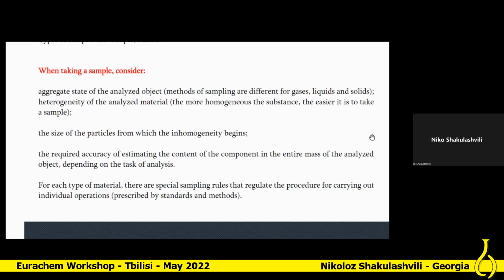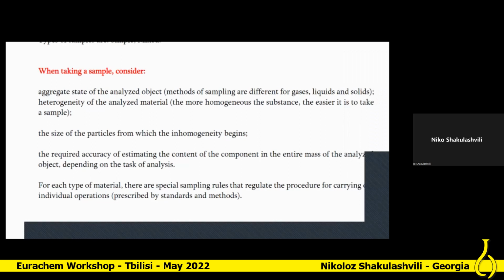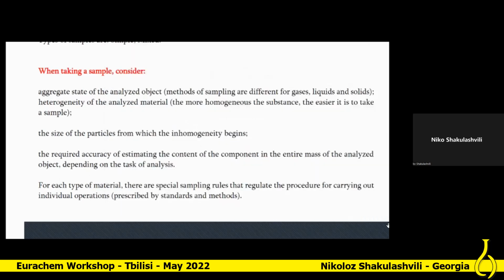We need to take into account homogeneity of this material, and this often happens, especially when it comes to sampling. Also, we need to know what is the required accuracy with which we will carry out this analysis.